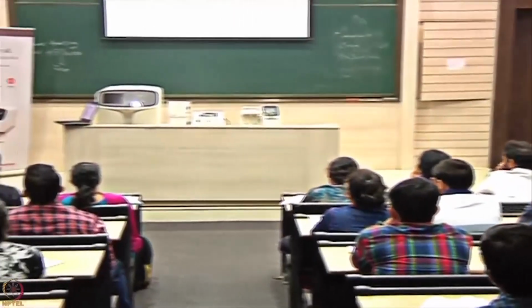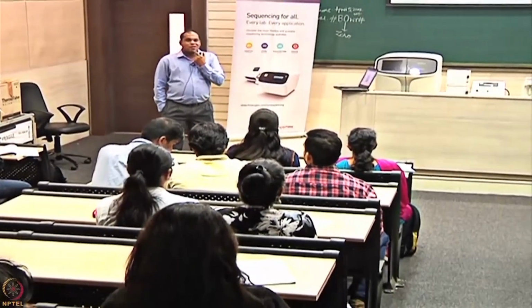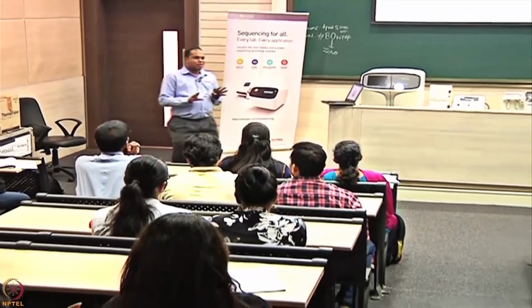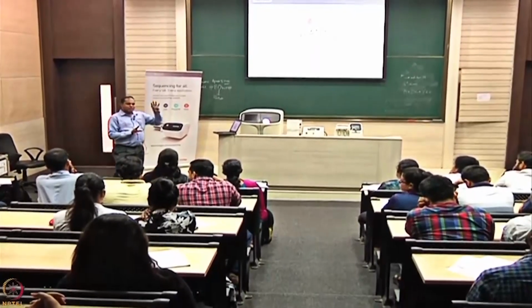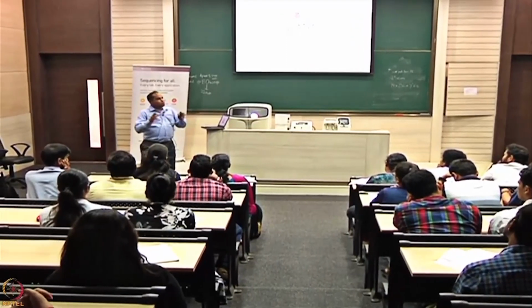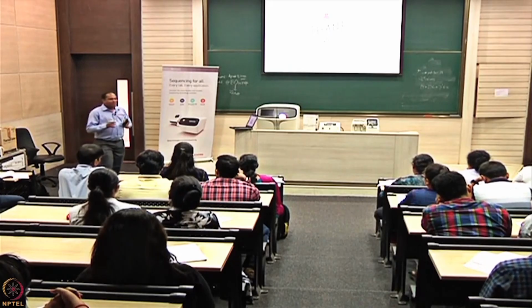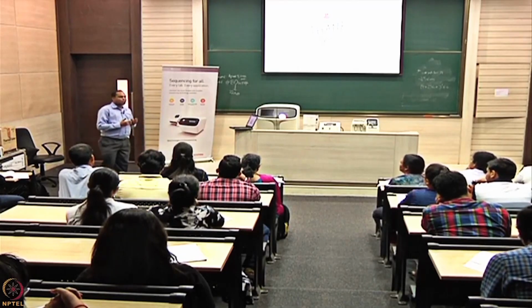Yeah. So, any questions about this? I hope you have got an idea or a feel of how the data analysis happens in NGS. The only thing over here was to take you through the entire workflow, how we start with the analysis, how we look into the particular gene designs, come to a level where you do the sequencing for the gene designs and then get it annotated through Ion Reporter. It's a tool that is freely available, and then looking for something like a quick response, there is the Oncomine Knowledgebase Reporter which helps you to do that.